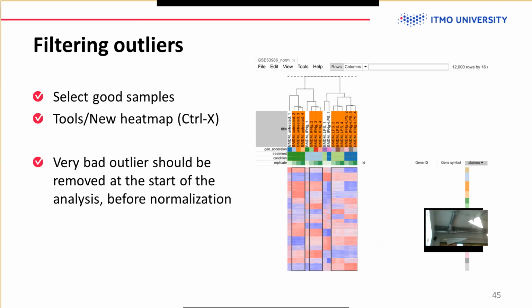You can probably guess that these first samples were somewhere close to the border of the well plate where all the samples were done, and maybe some oxygen leaked or whatever. So basically, we have some kind of batch effect that affected these 4 samples.